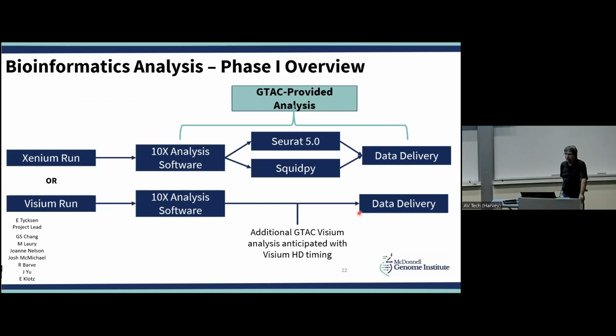Okay, now what about all the analysis stuff, right? We probably get this question as much or more than anything right now. Interestingly, even externally. Some of the pharma companies that we work with are very much used to us generating FASTQ files and sending them the data, because we have to process it here. With this platform, we've been getting asked by the pharma companies, is there any analyses you can provide for us? Because they literally don't know what to do with the data.